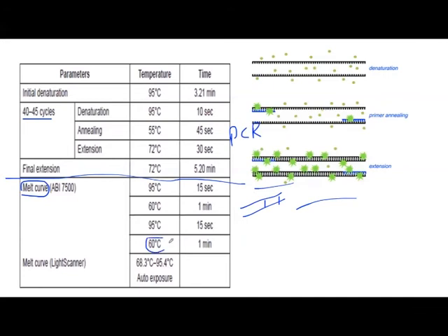So here in this melt curve, you're going to do what is called a melting curve. You're going to increase the temperature from 60. So if this is the temperature, the x-axis is not cycle number, it will be the temperature, and the y-axis is the fluorescence. So from 60, all the double-strand DNA are actually formed and they are highly fluorescent. And then you slowly increase the temperature to 95. So you start with 60 and you end up with 95 degrees. What happens to this DNA? It starts to denature, and whenever it denatures, the SYBR Green will leak out and the fluorescence will go down.